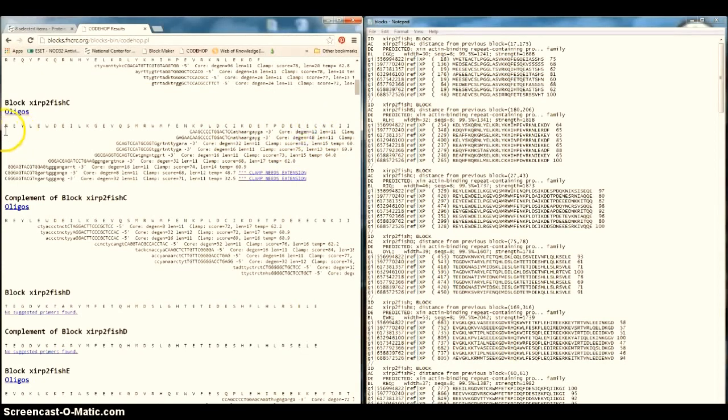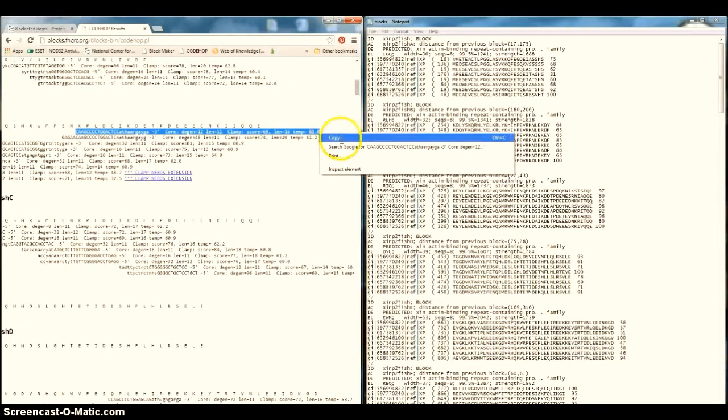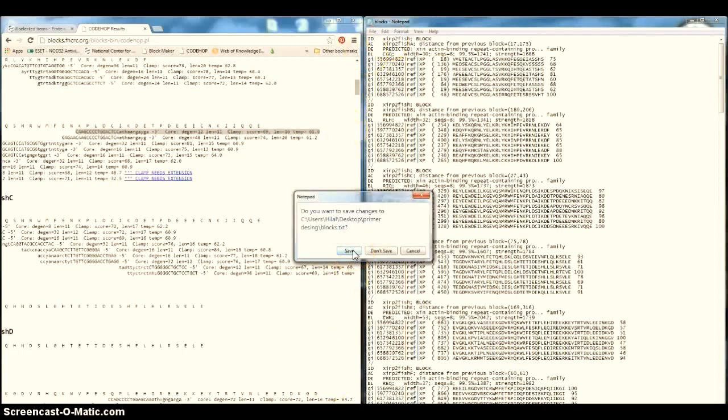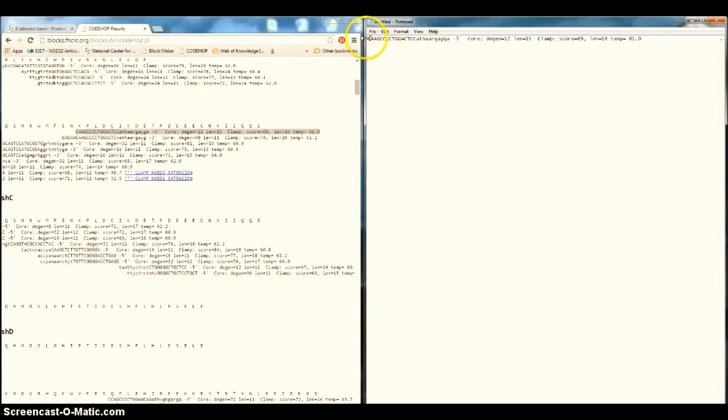So in this layer, the primer which matches here, from K to E, we can choose. So usually I copy all, to not forget what I choose. So let's make a new file, and here primers.